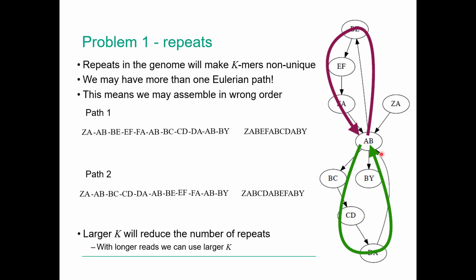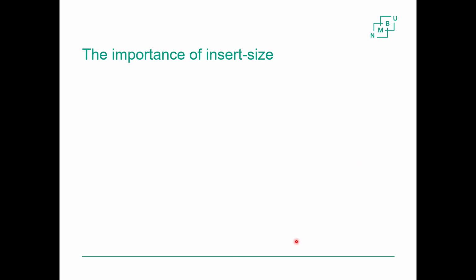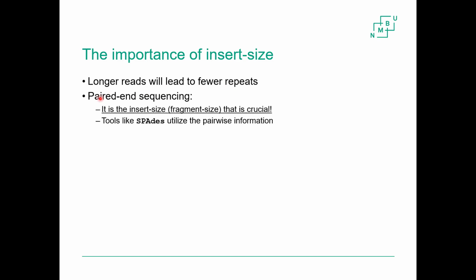Right? So if we could look at 3 letters at a time here, we would probably solve this, right? So with longer reads, we can also use larger k values, of course. I should also mention the importance of insert size. So remember, longer reads lead to fewer repeats.